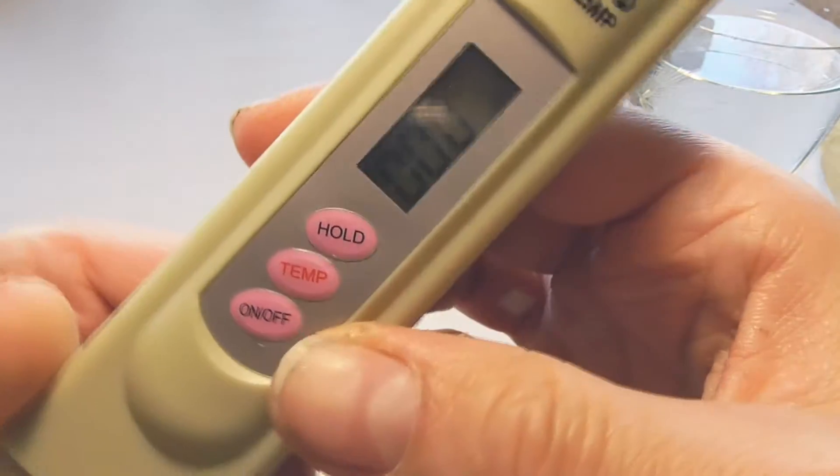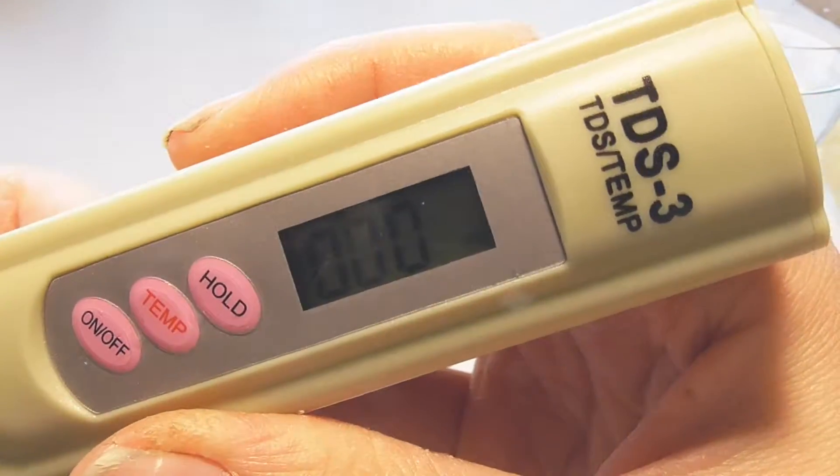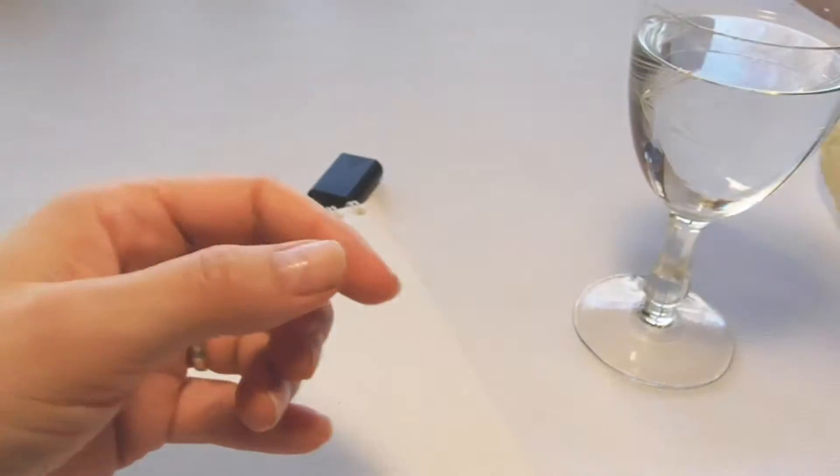This portable digital TDS meter tester can measure your water purity.